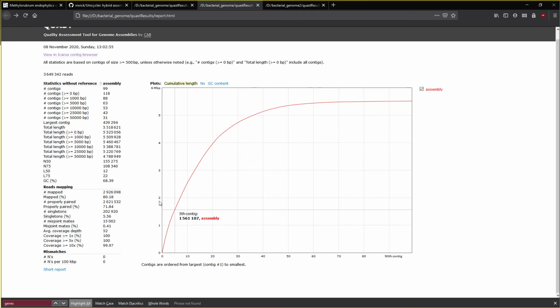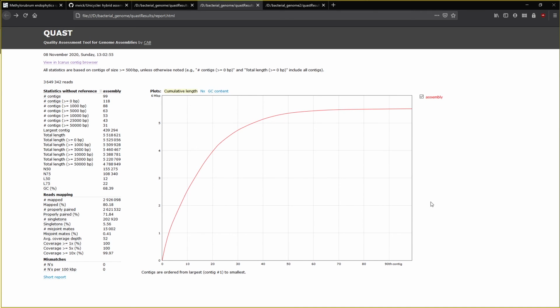Now that we have a couple different pipelines down with the RNA sequencing as well as the whole genome sequencing for bacteria, we can look at building a workflow using Snakemake, something like that. There's also Nextflow, where basically you put in your rules that you want. So initially you're going to have all of your reads be trimmed, and then you have to map your reads for RNA sequencing, or do Unicycler here to get an assembly and then do the downstream stuff.